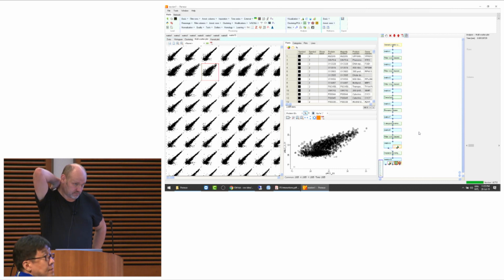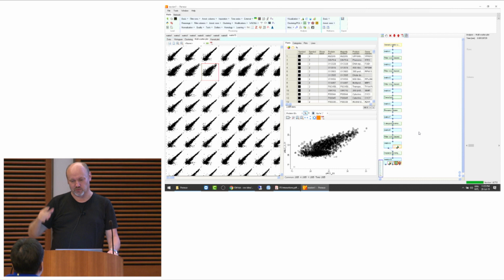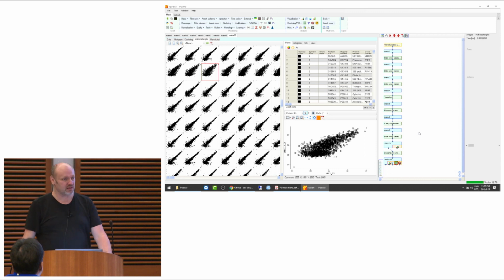If you go through a series of analyses and then you discover after you've done all the analysis that you actually have an outlier and you remove that outlier, will it recalculate all the other analyses that you've done before removing the outlier? No, that's not what we're working on. So that's what would be called re-executable workflow. So that's at the moment not happening, but that's something that's on the to-do list with very high priority. Yeah.